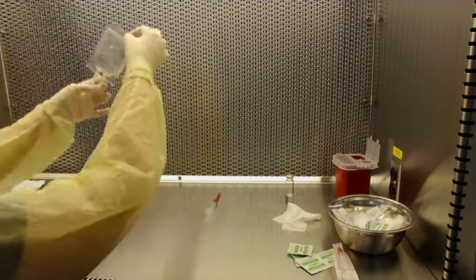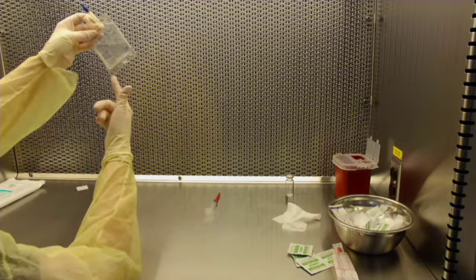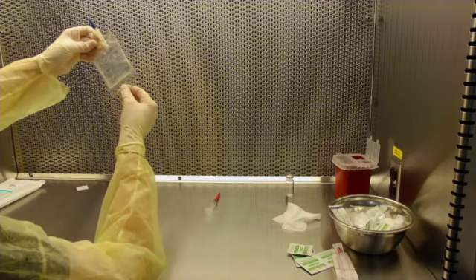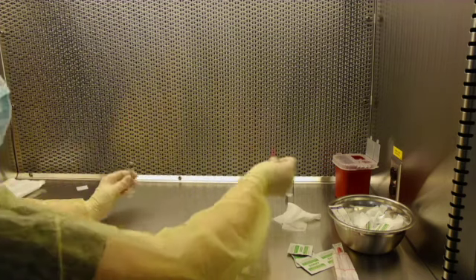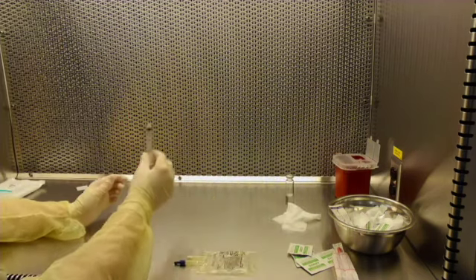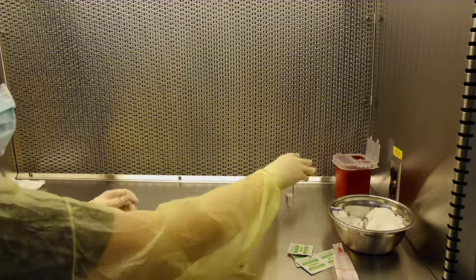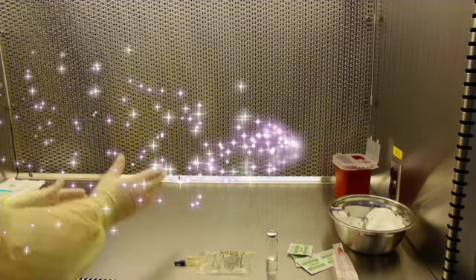Flip from an upwards angle to a down angle. And remember, bubbles will rise, particulates will fall. What we're checking for here is any kind of particulate matter, coring, or anything that might determine that the bag is not safe. Needles go in your sharps container. Syringes can go into your garbage bowl. Tidy up your hood. The vial will come out of your hood. A broken ampule would be thrown in your sharps.